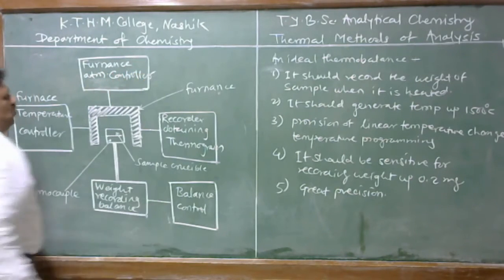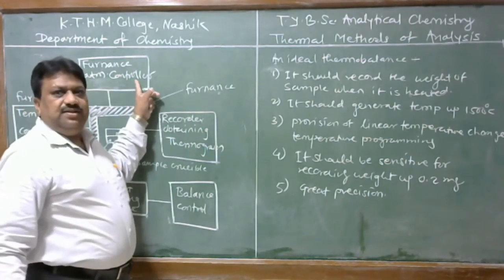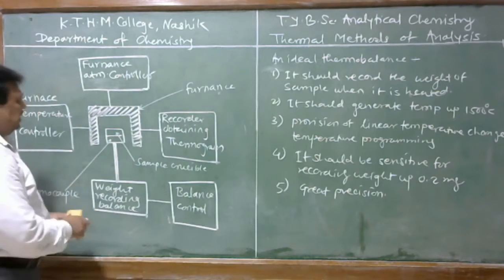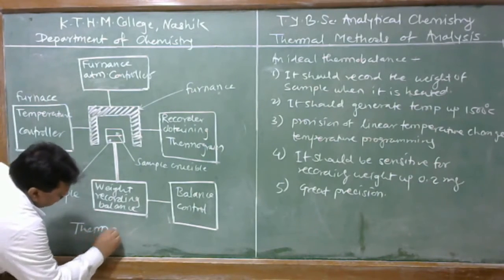That means which type of atmosphere we have to provide here will be controlled by this compartment. This is a schematic diagram of the thermobalance.